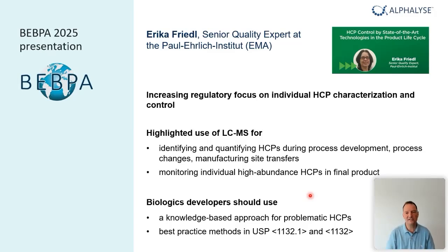Now there are all these methods, which ones should we choose? And the answer was that you, as the biologic developer, have to present your product and your process to us and show that you have a good control strategy on HCPs. You are expected to use best practices. You will have time to catch up with these new methods. You will have time to catch up. It means in the future you will be expected to provide these.